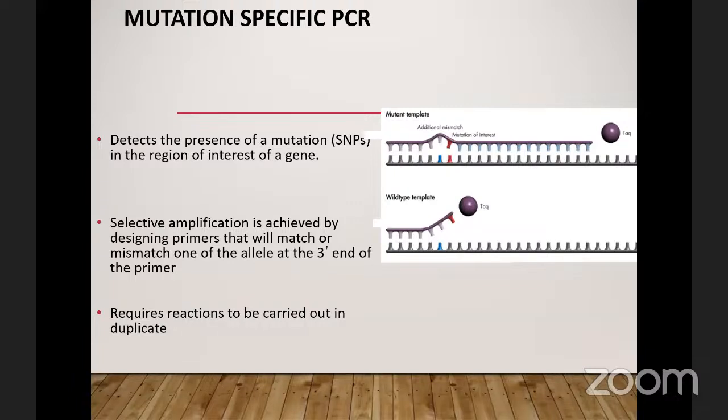And the funny part is that the organism you are targeting, and what the RDT you are using is actually made to target in making that diagnosis, might have changed in this same organism. So when we are looking at mutation-specific PCR, we are trying to find out, oh, at so and so region, is there a way we can copy this region of the gene and check if so and so mutation has happened in this particular region of the gene?